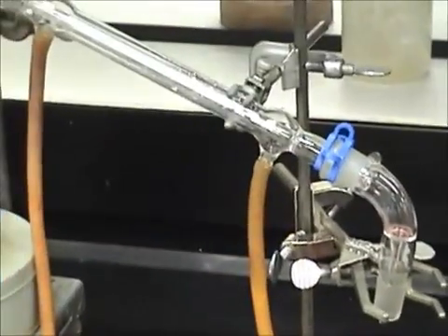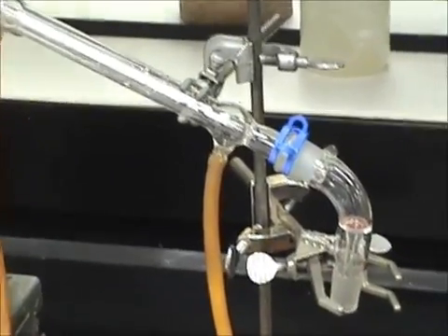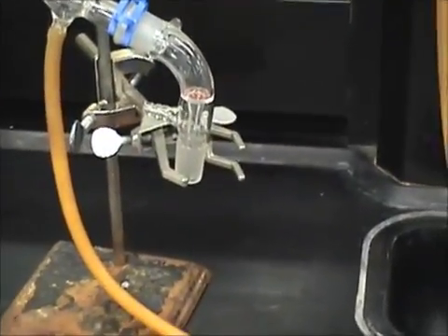Now, we can add a receiving flask to the end of the vacuum adapter. Secure this joint with a clip as well.